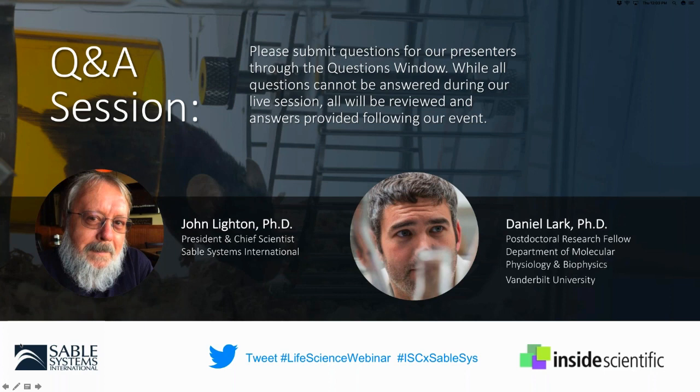Okay, if we're dealing with mice, the default flow rate is 2 liters per minute. That's about 5 times higher than the conventional systems. And you can easily increase that for mice to 3 or 4 liters a minute if you wish. There'll be a slight reduction in the delta O2 and delta CO2, but we have enough resolution to manage that without any particular problem. The maximum flow rate of the system, depending on the particular system, would be 4 or 5 liters a minute, and the higher flow rates are used mostly for rats. But if you really want a very fast time constant, you can certainly increase the flow rate above 2 liters per minute for mice.